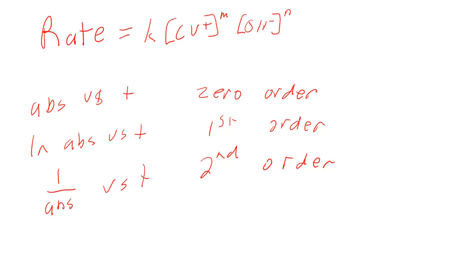So you have learned in class that concentration versus time, or natural log of concentration versus time, or 1 over concentration versus time. Since Beer's law shows us that absorbance and concentration are directly related, we can substitute absorbance here. So once you look at your reactions, you will be able to tell whether your reaction is zero, first, or second order with respect to the crystal violet. Then once we've determined that, the next thing that we want to know is what is our reaction order with respect to the hydroxide.